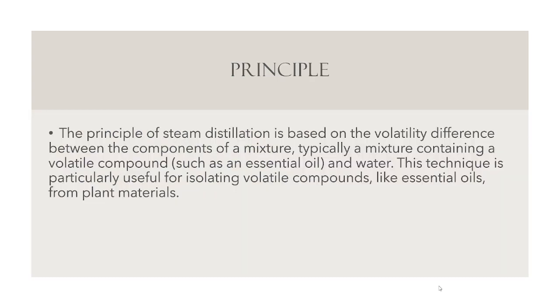What is the principle of steam distillation? The principle of steam distillation is based on the volatility difference between the components of a mixture, typically a mixture containing a volatile compound such as an essential oil and water. This technique is particularly used for isolating volatile compounds like essential oils from plant materials.